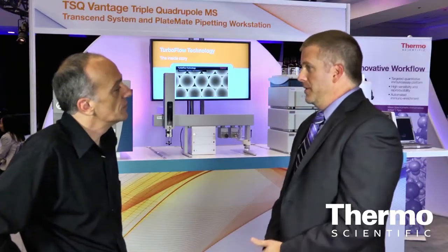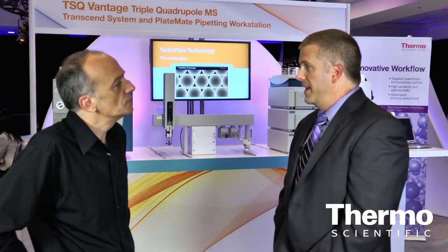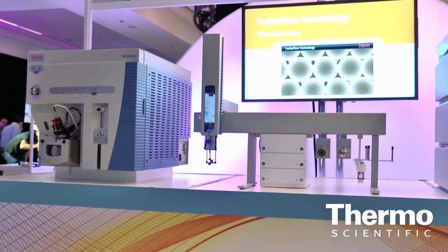Our product line is very diverse. We have a fantastic price-performance entry-level triple quad, which is our Quantum Access Max — great for customers doing routine quantitation who don't need ultimate sensitivity but need robustness. Moving up, if they need a little more sensitivity, we have our Quantum Ultra. And then for the upper echelon, we have our TSQ Vantage for customers who need the ultimate in sensitivity.